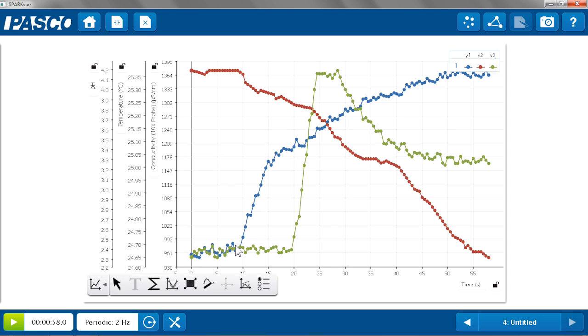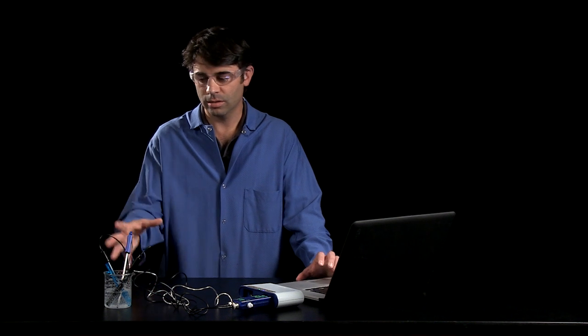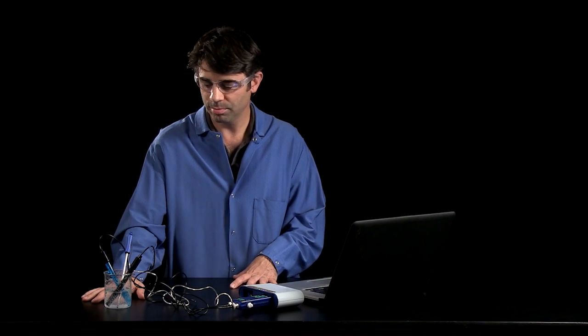So, now we can see my pH, which was my Y1, was increasing. At the same time, my temperature started dropping, my Y2, and the conductivity started to increase. So, we can, again, tie in all those concepts with a very simple process as long as we have the data to analyze it.